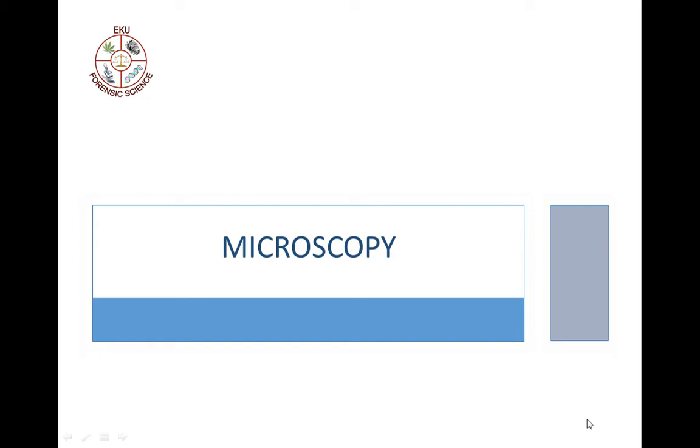We'll discuss the differences between the optical light path of a stereo microscope and a compound light microscope, and then also discuss how a polarizing light microscope works. We'll also define refractive index, a common term that's used with many of the forensic samples in identification, and also various instruments that have microscopic abilities.